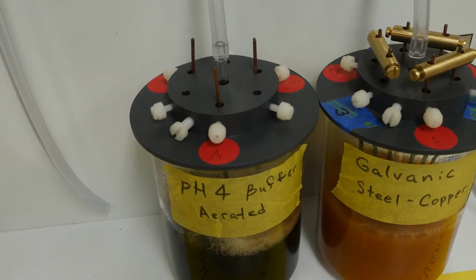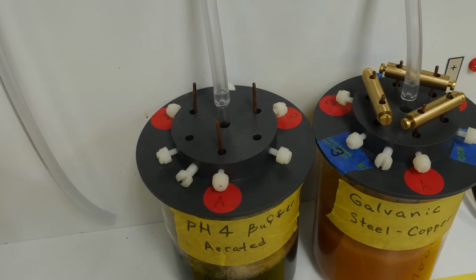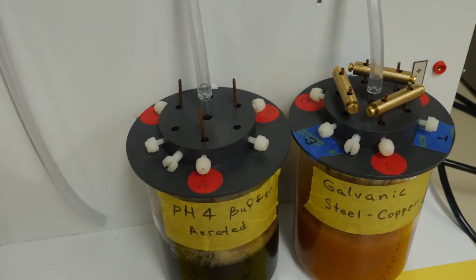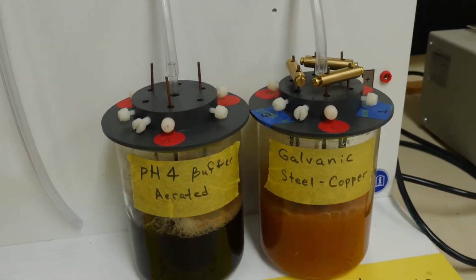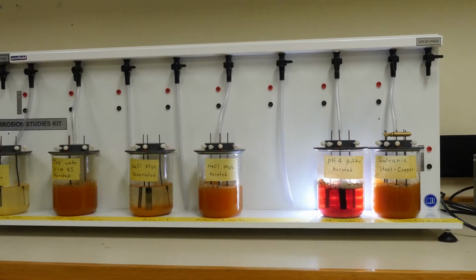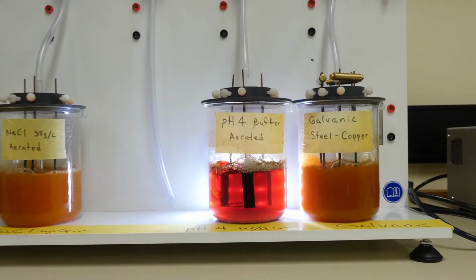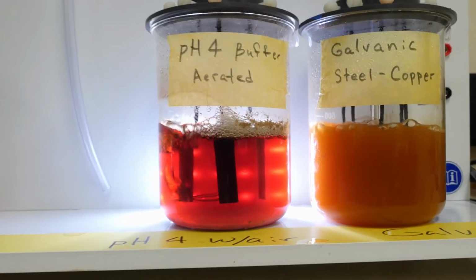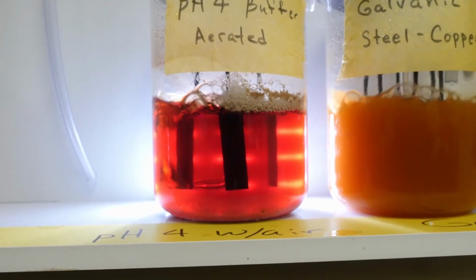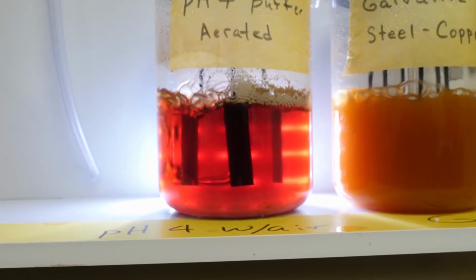On top, the cells have had the positions of the steel coupons labeled. The pH 4 buffer solution started clear and became progressively darker during the experiment. With the aid of this backlight, you can see that the solution is not cloudy, as would be the case if they were suspended solids, but the solution itself has simply become a dark reddish color.